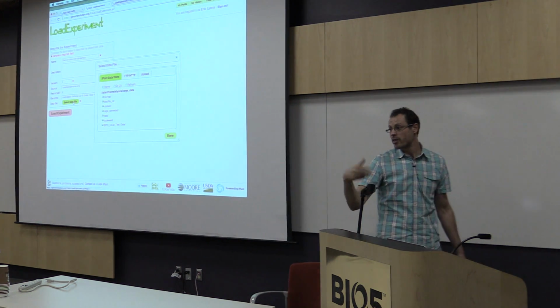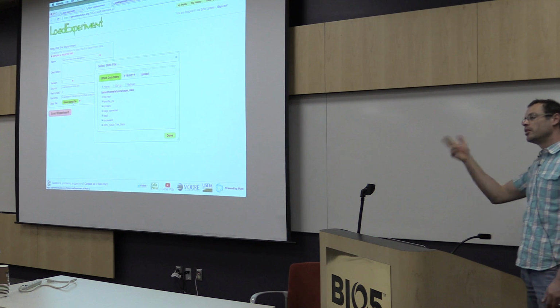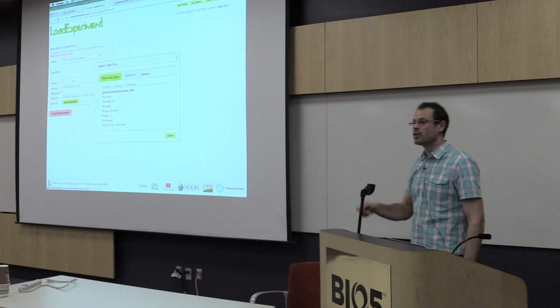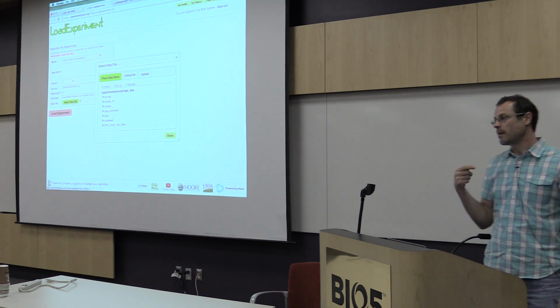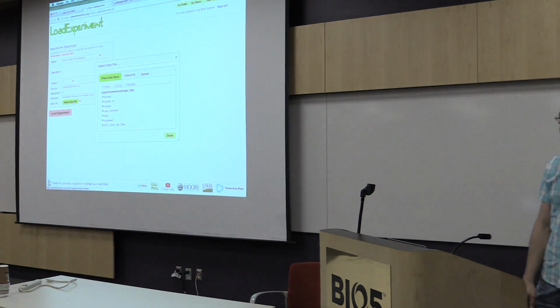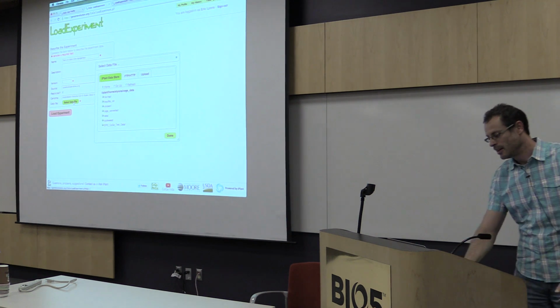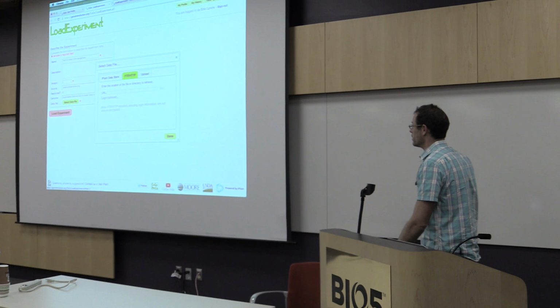So if you have a 30 gig file, you just pull it off the sequencing machine, put it in your iPlant data store, put it in the CoGe directory, and then CoGe can go and pull that data for you automatically. This makes our data management easy because you can now leverage iPlant for managing gigantic amounts of data, and we don't have to, and we can't. The technology is complicated to stand up.